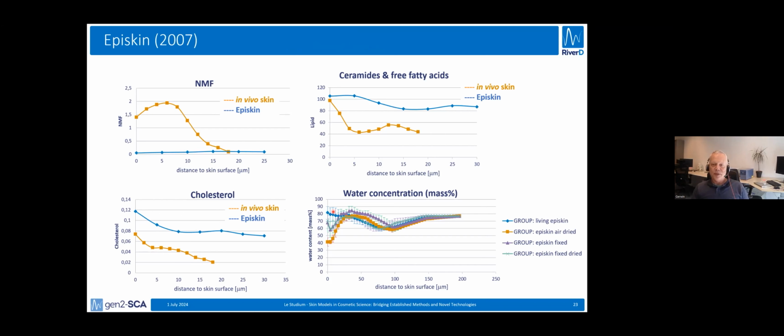So I cannot say that we've made a very systematic study of all the skin models that are available, and we probably don't have all the newest skin models and developments there. But throughout the years, we've had the opportunity to do some measurements on skin models, and one of the first was on the skin model that was then available from EpiSkin.